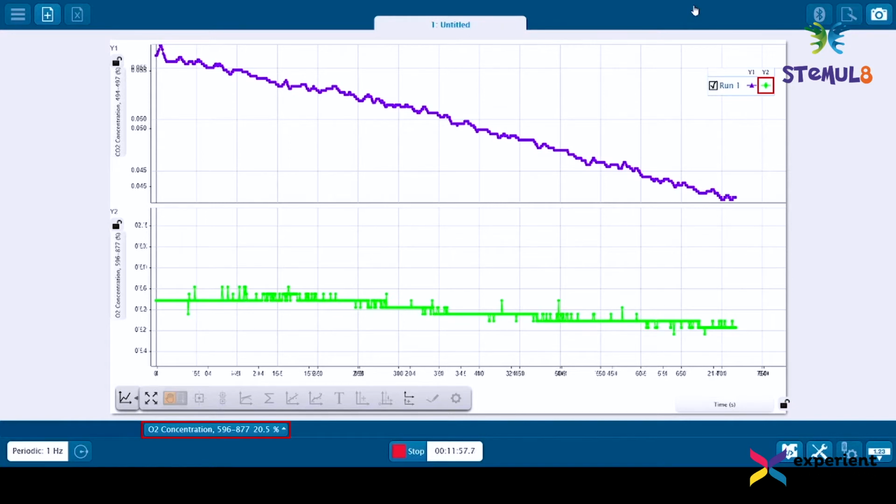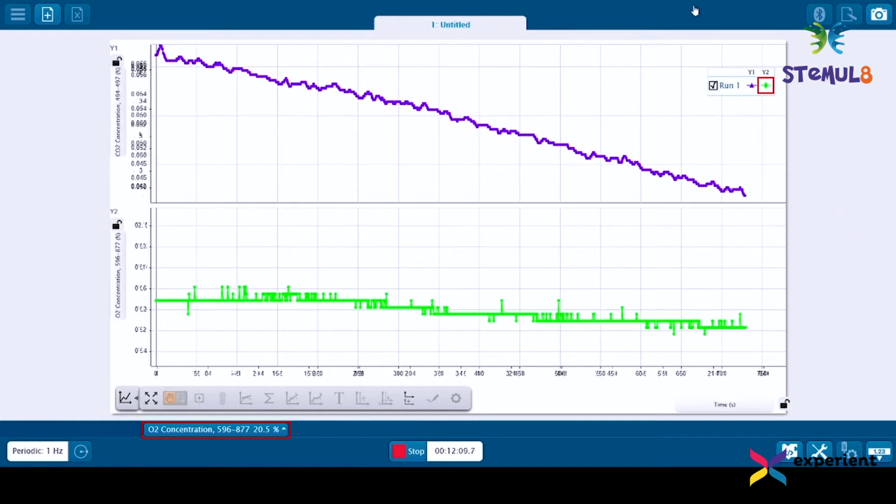We had started the process a bit earlier when we were setting it up, so the carbon dioxide level was pretty high at that time. But now, since the lights are all turned on, the level of carbon dioxide is gradually dropping, and it has now dropped by almost 30%, or maybe more than that, from 0.066 to 0.045. So around 30-35% it has dropped. That means the plant has utilized that carbon dioxide to do the photosynthesis.